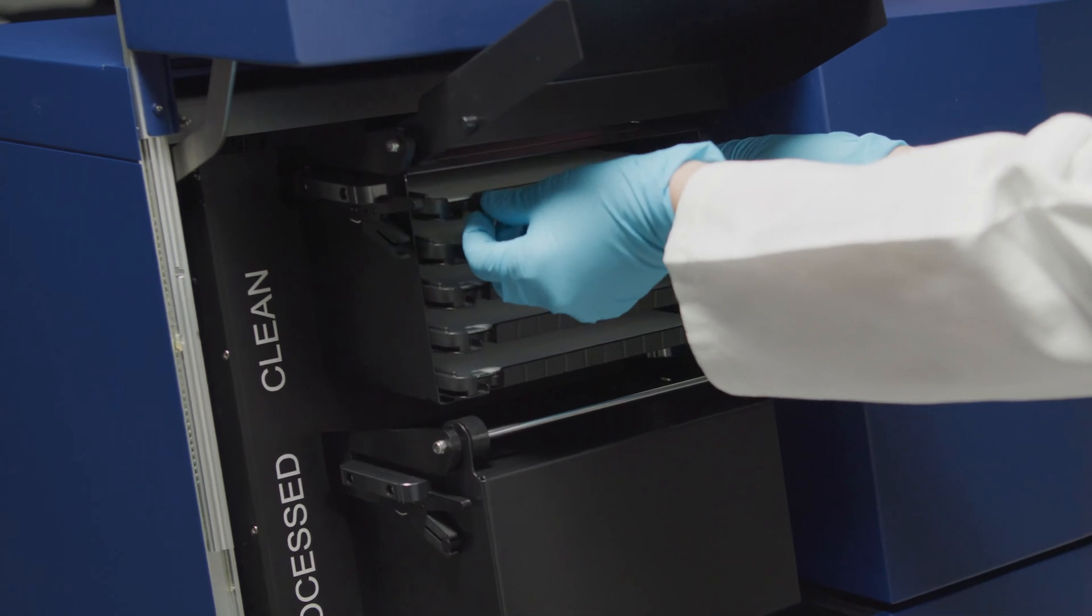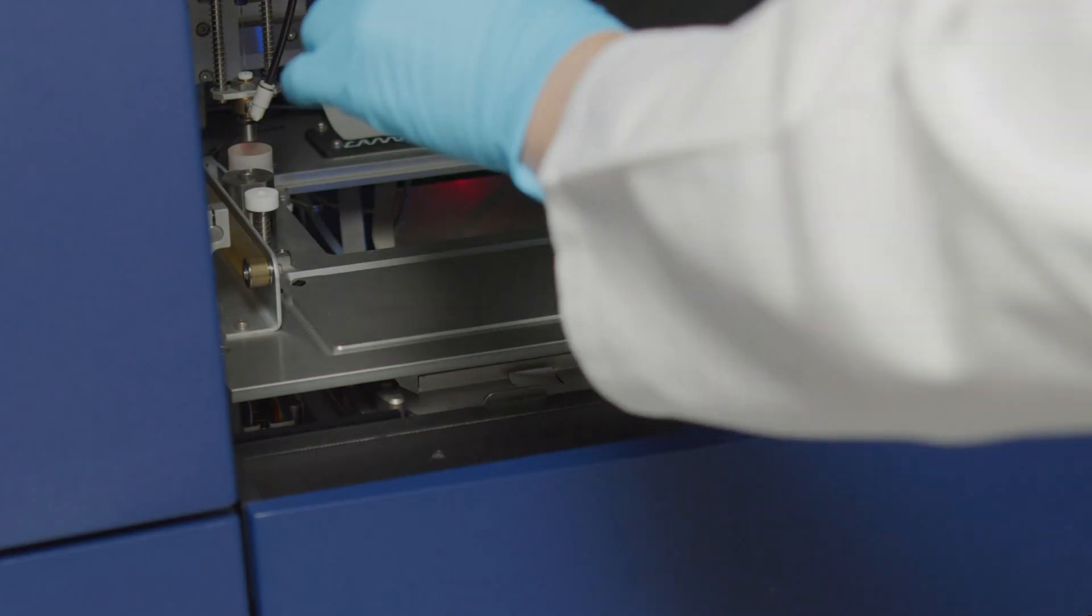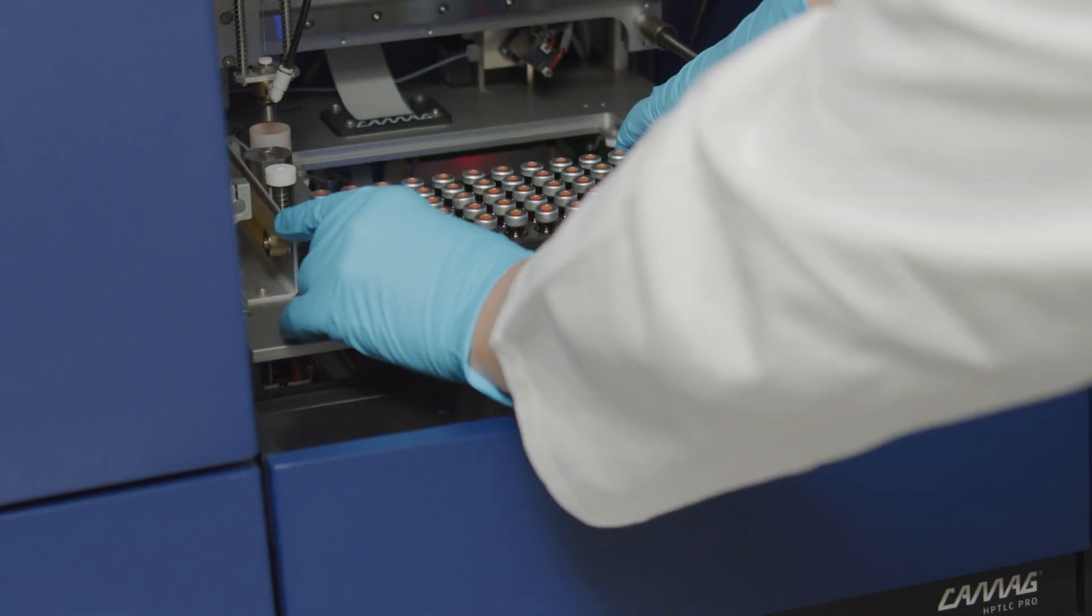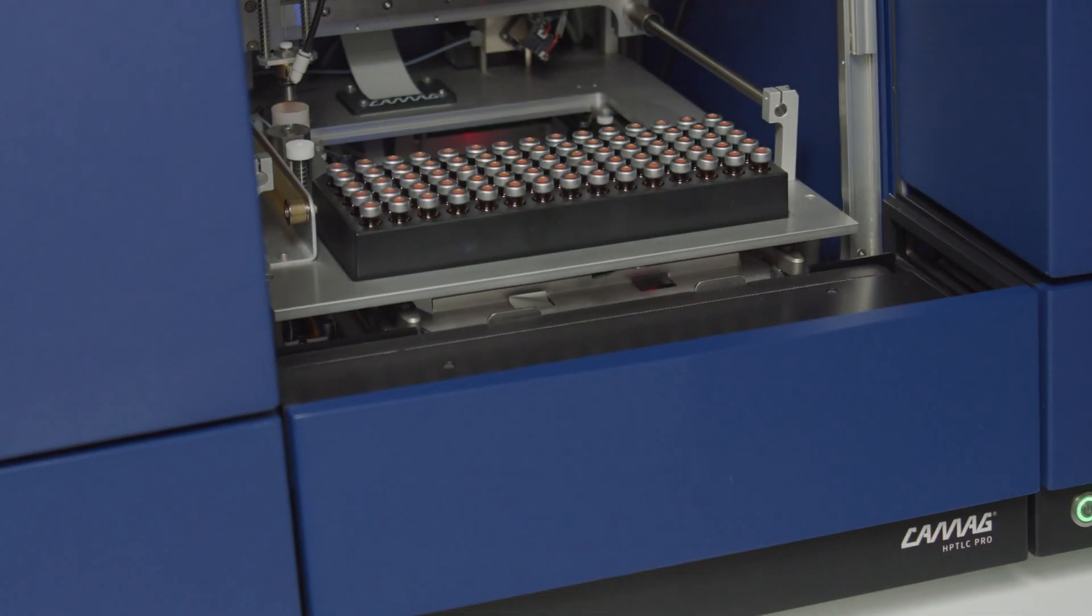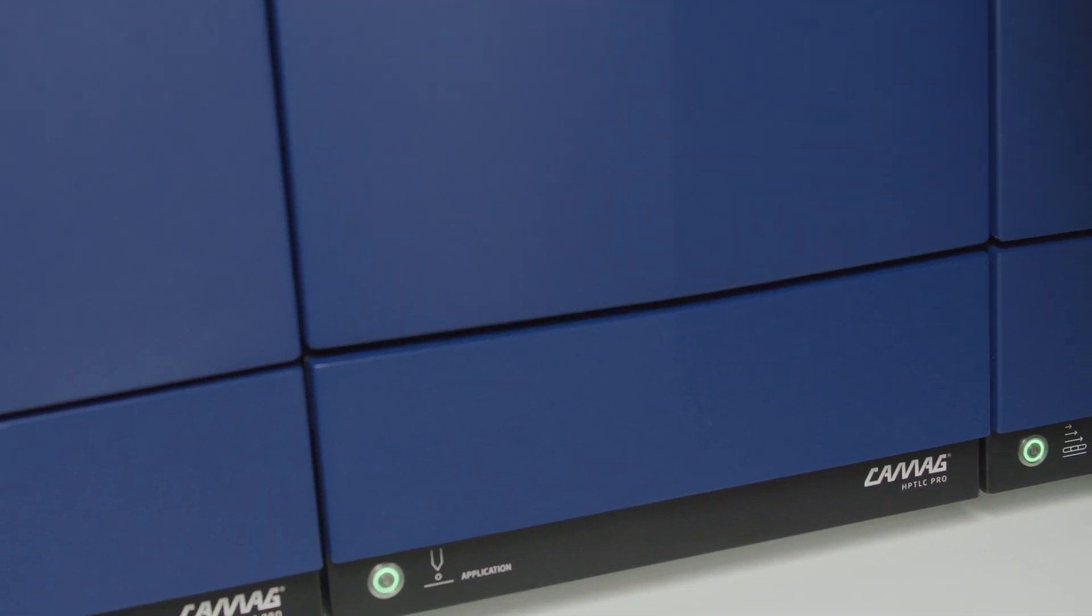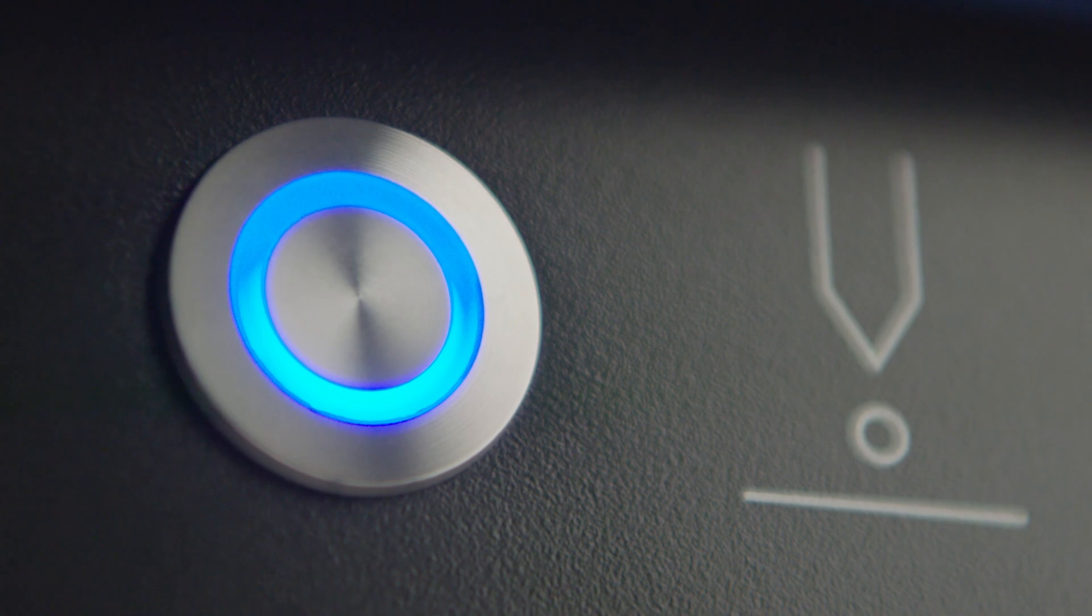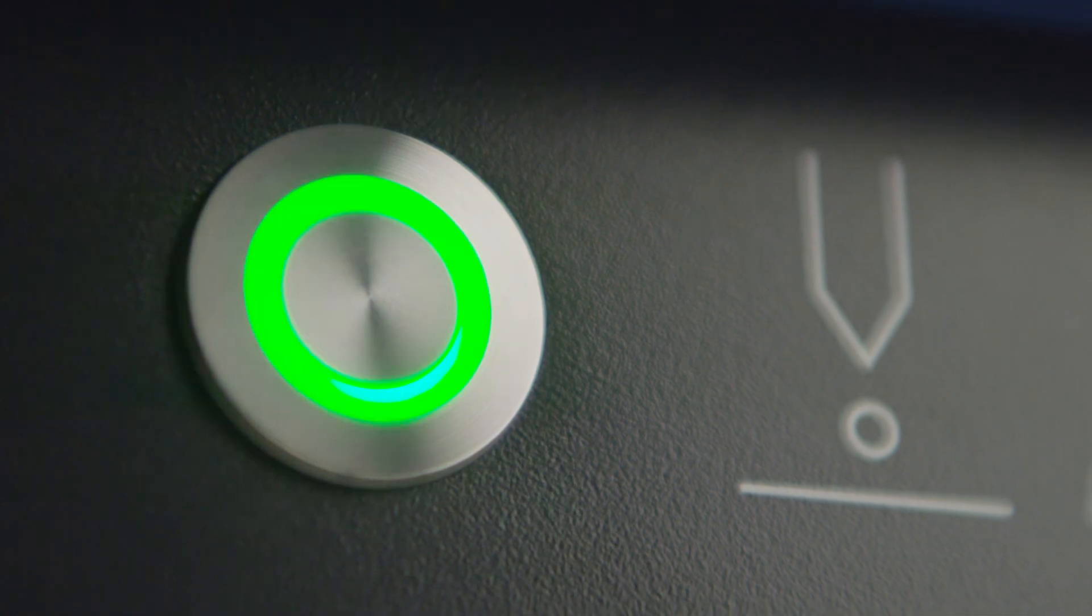Designed for high-throughput sample analysis, the HP TLC Pro system revolutionizes high-performance thin layer chromatography.